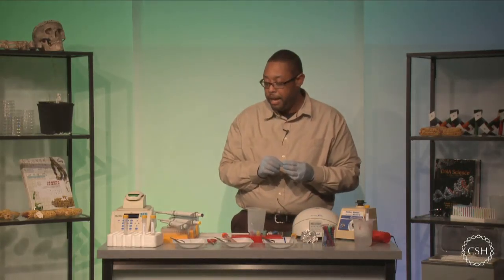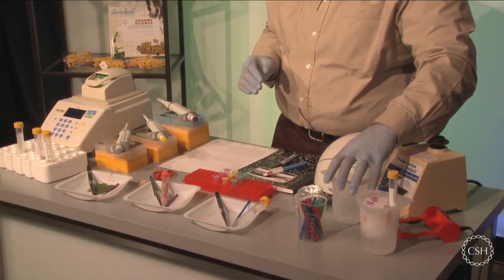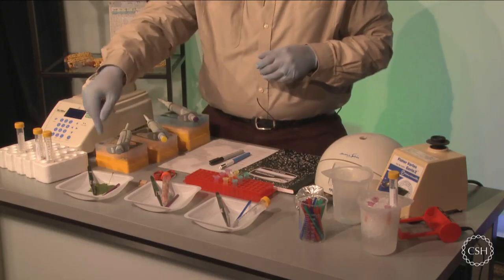Okay? Now, what I want to do here is get started. So I'm going to put a garbage beaker here to my left because I will need to have some disposal area. The first thing I'm going to go for is the plant.